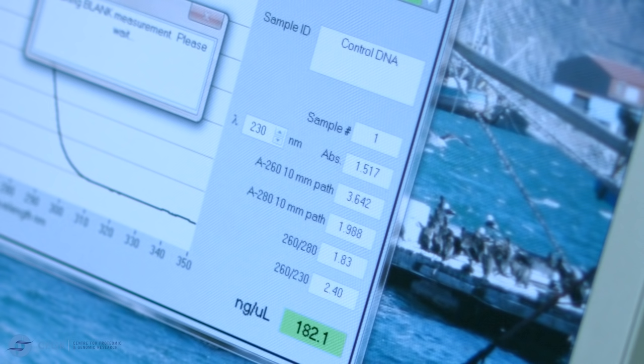When reviewing the results, we can see that one of the samples hasn't performed optimally, while the other one has. If the sample was to be used for the genotyping assay we will be carrying out, it would require an ethanol precipitation step to purify that sample.